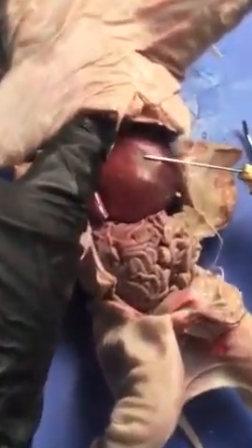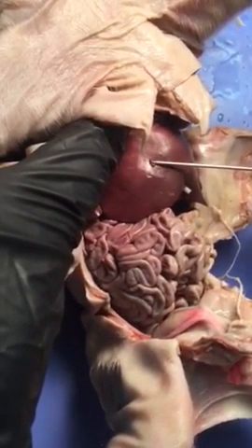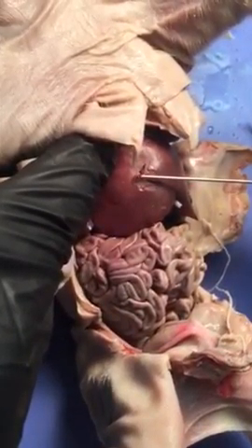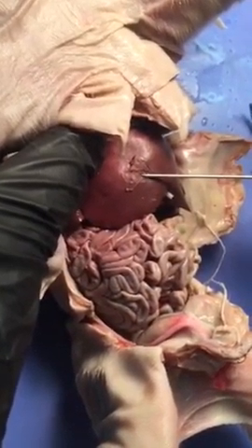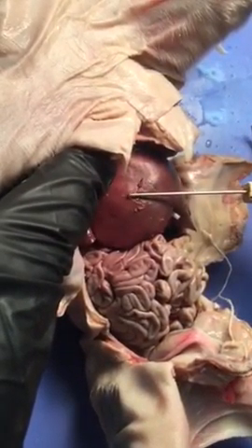Thank you. Okay. And so then if you look closely, you'll see that the liver has this shiny appearance, and that's because it is covered over with a very thin layer. And this is the visceral peritoneum. There you can kind of see it right there. Underneath, there's actual liver tissue. Okay, this stuff is the peritoneum.